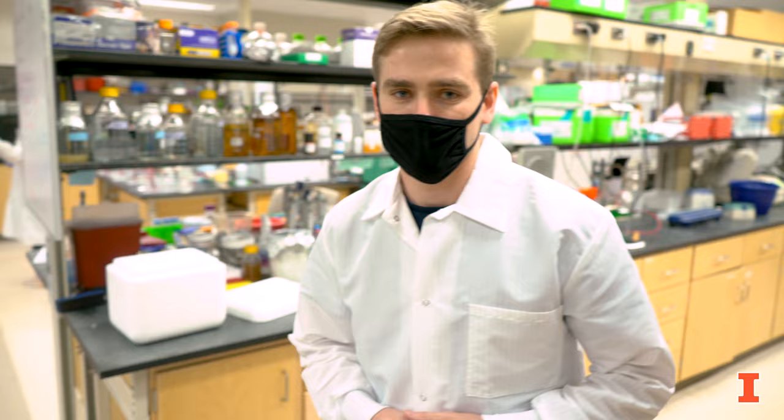Hi, I'm Michael. This is the Dr. Zhao lab here at the Institute for Genomic Biology, and I'm here to show you guys around the lab and also to show you a few wet lab experiments.